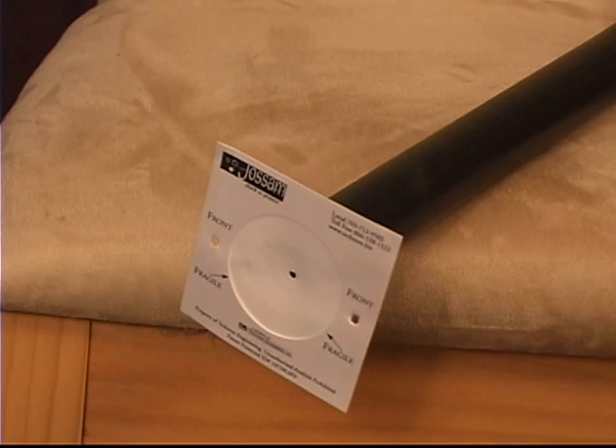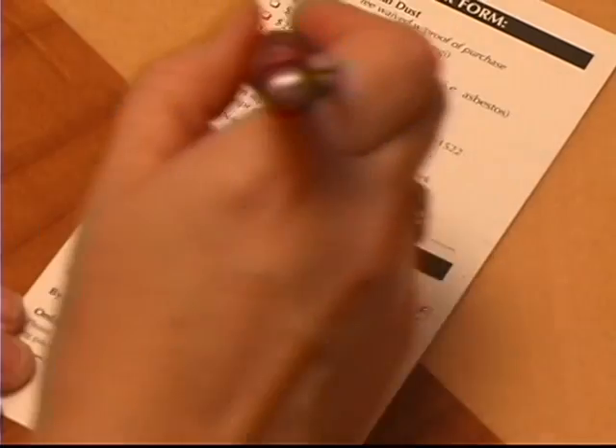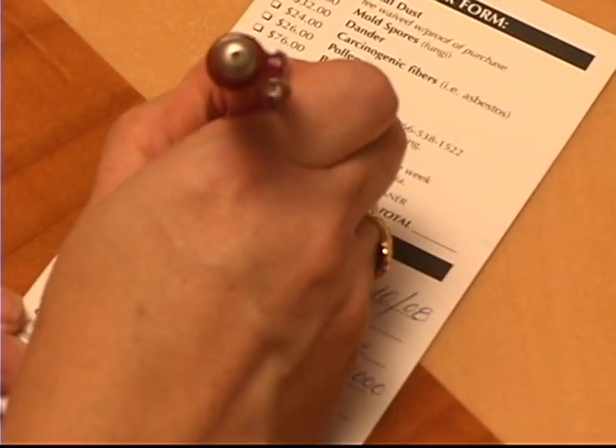Step 4. Run the vacuum cleaner for a minimum of 6 and a maximum of 9 minutes. Step 5. Record your start time on the supplied order form and check vacuum cleaner method.